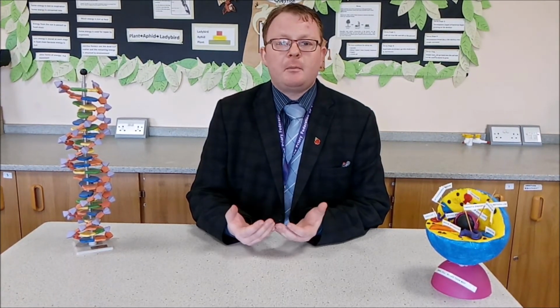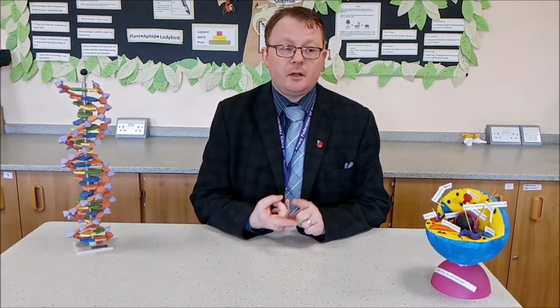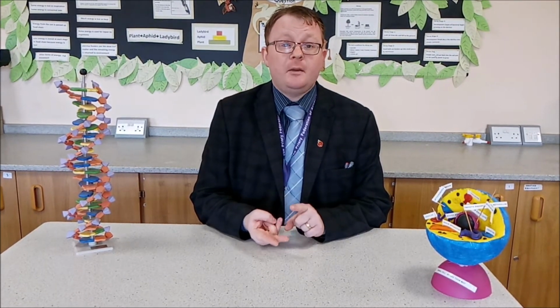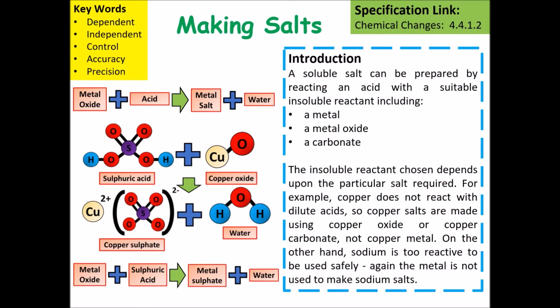In this video, we will look at how we make copper sulphate and cover the making salt required practical. We'll go through some of the background information and the method that you need to know. When thinking about the production of copper sulphate in particular, we first need to think about making salts.